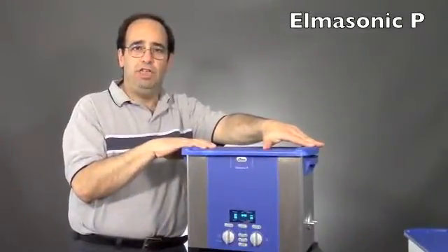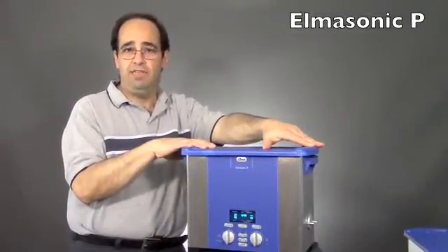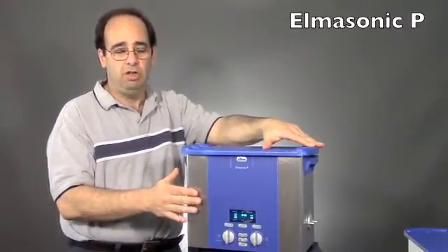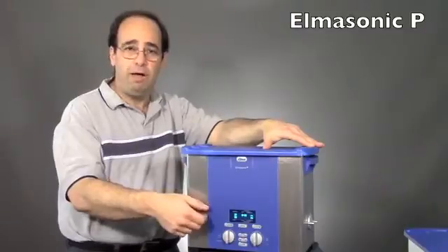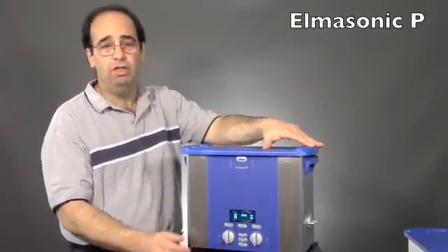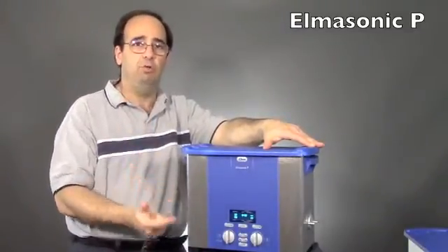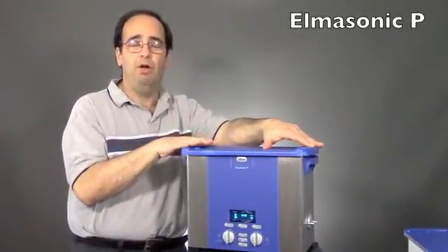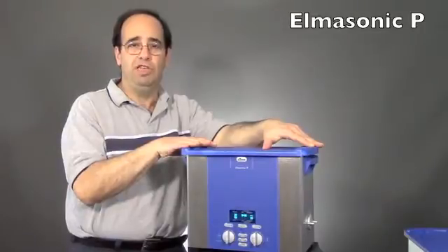If you need to clean an item which is sensitive to cavitation, you can also adjust the power with this unit. So this allows you to go to full power or dial it all the way down. You've got multi-frequency, power control, all the modes available, and a heck of a lot of power all in this beautiful German design package. It's a really great unit.